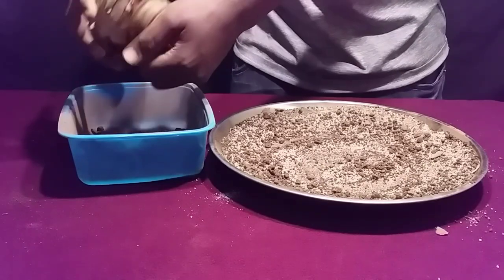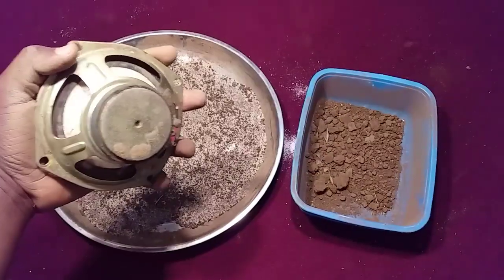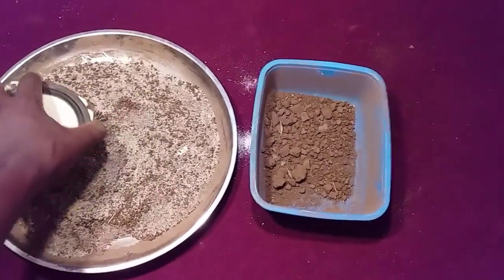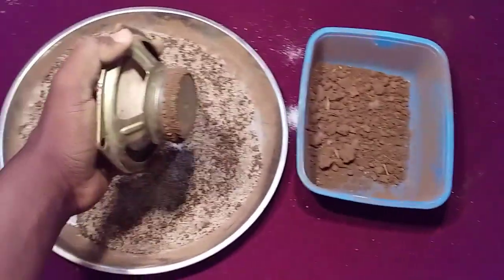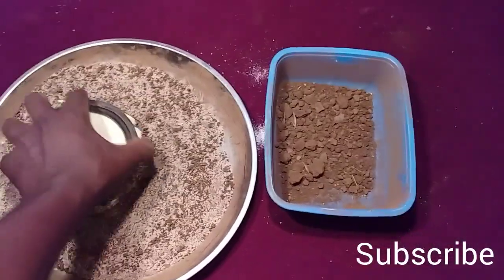You can see here that by just holding this magnet above the mixture of salt and sand, I was able to remove a significant amount of sand. I could continue doing so, but I will never be able to remove all of the sand, because there are very small dust particles that will not be attracted towards the magnet. So I move on to the next stage.